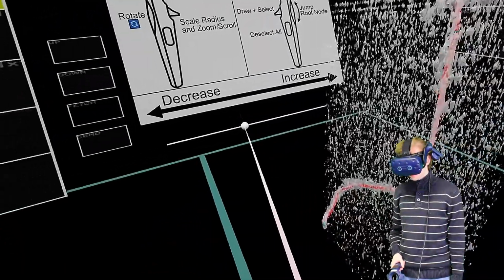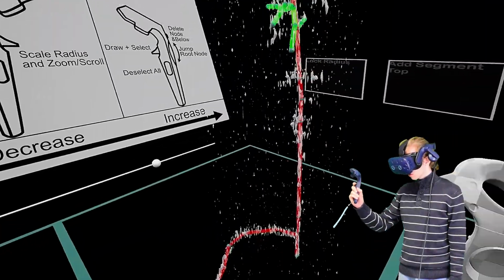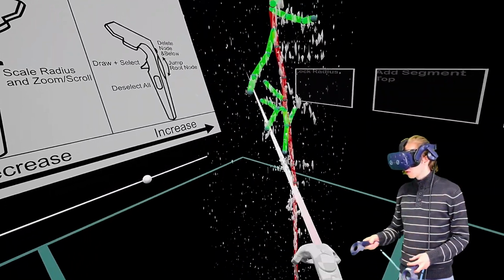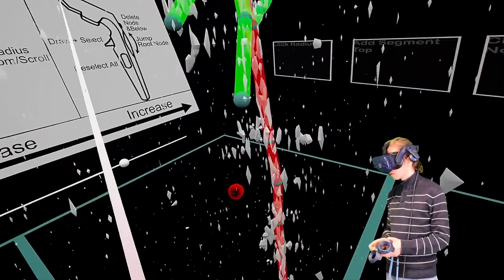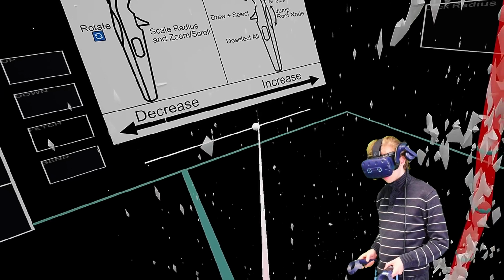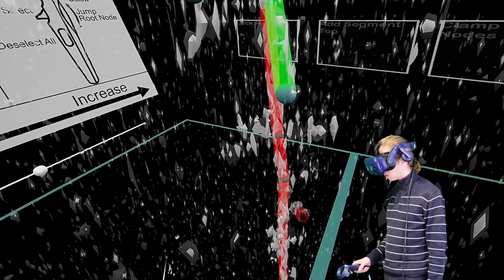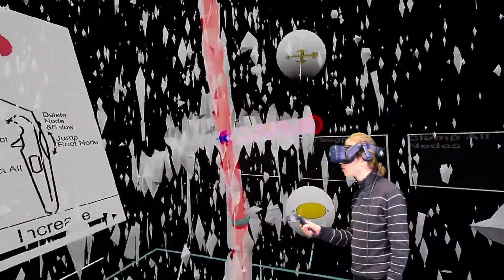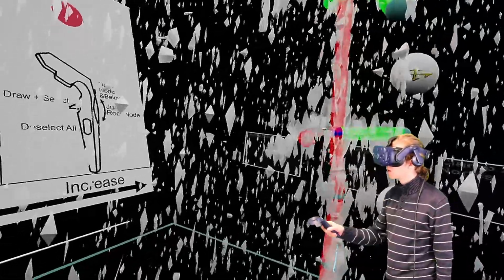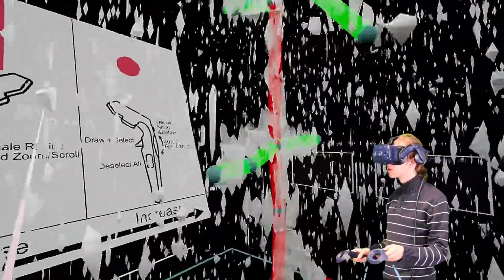For data exploration, users can alter the signal cutoff, meaning the value of the ISO surface, to adapt the view on the data. This is mostly not necessary when dealing with segmented data, but can be very helpful when trying to extract root system architectures from particularly noisy data. Navigation within the virtual environment is mostly extrinsic, meaning that the root system and MRI scan can be moved within the space while the user navigates around it. Tracing and editing the root system architecture is done through editable nodes that the users can attach new segments to, as well as move the data.